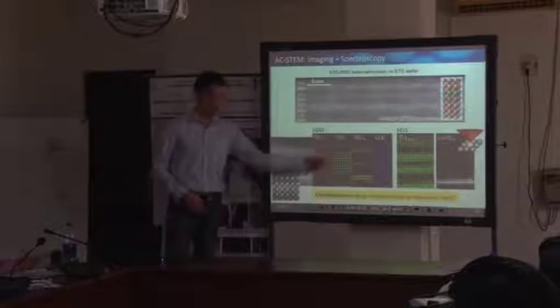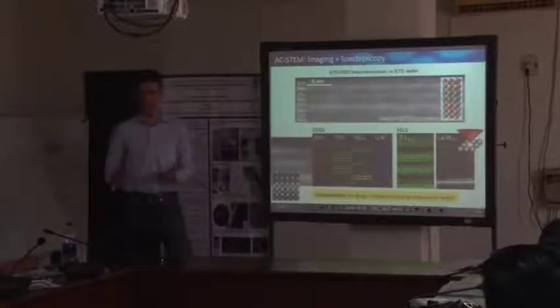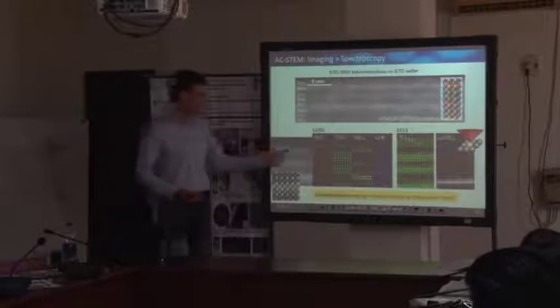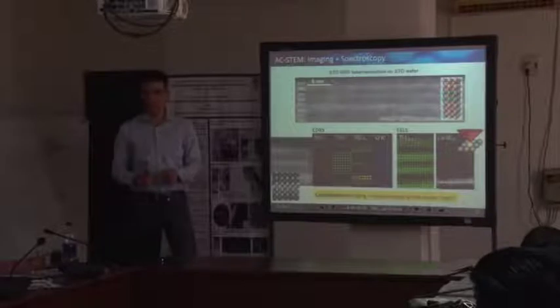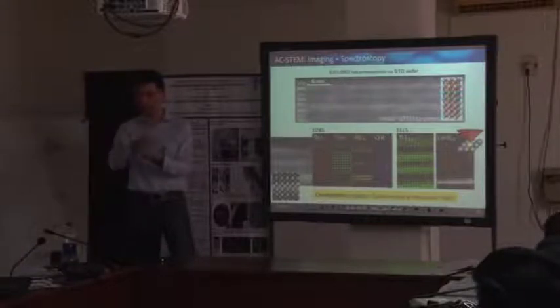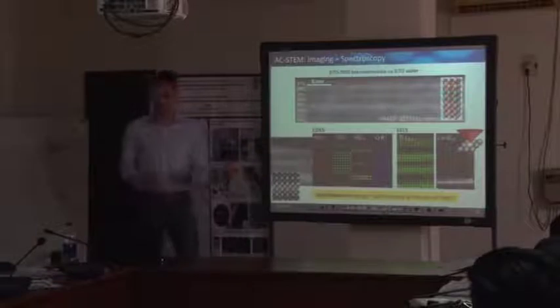We want to come up with decent spectral intensities, isn't it? So the dwell time would be somehow, and if you only probe, let's say in this particular case, the sample might be 10 or 20 nanometers thick, you can imagine that for each atomic column there are only, let's say, 100 atoms or so. You just probe the emitted X-rays of a very small number of atoms, and within our dwell time, our measuring time, the sample might easily drift, let's say, by one atomic column in one direction.